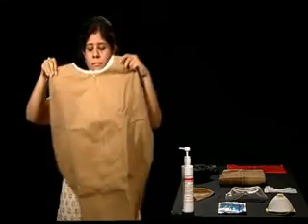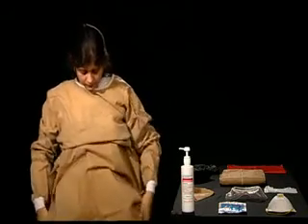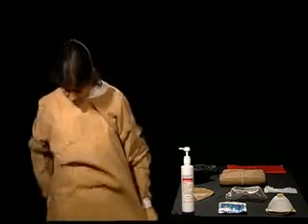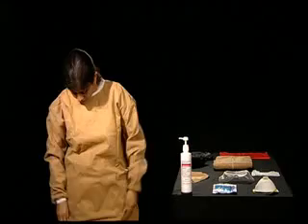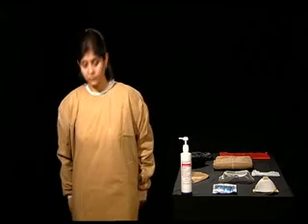Unfold the gown and roll it over your head. Using your hands, zip up the body gown and tie the strings behind your back. Make sure that the hair is neatly placed inside the gown. Straighten the gown around the neck, cuffs, and overall to be certain that it fits well. In case the gown is small, use 2 gowns to cover any place which could be exposed.